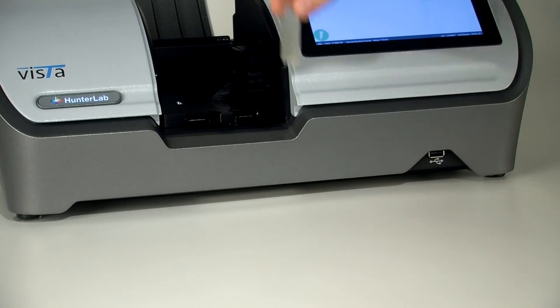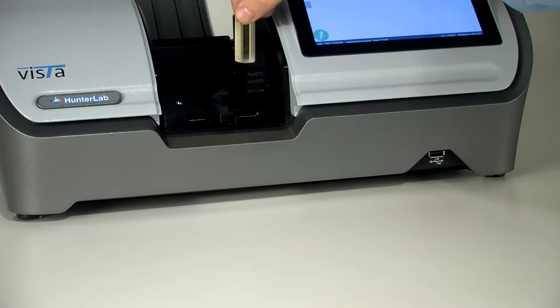Now place your sample into the holder. Ensure that the clear side is against the wall.